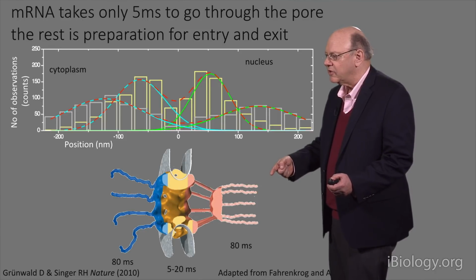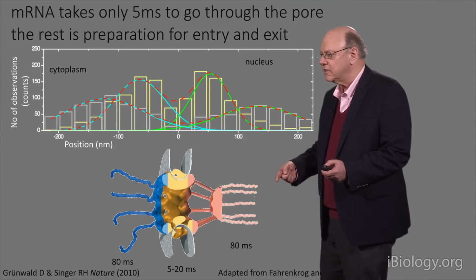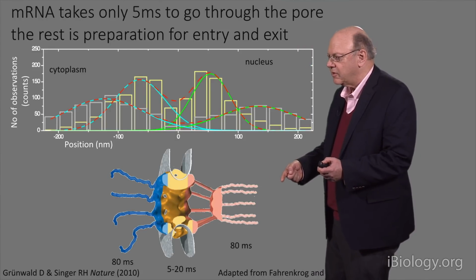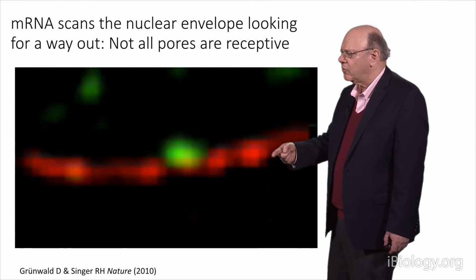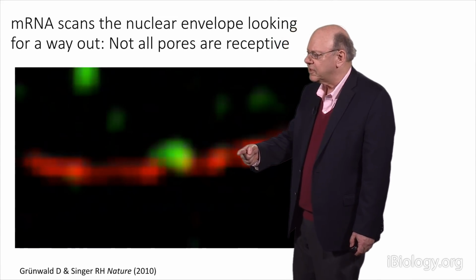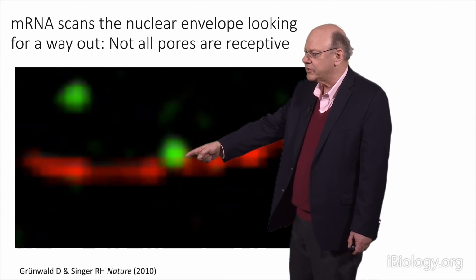Okay, and you can see other interesting observations when you're looking at this in real time. For instance, here's an example where this particular RNA molecule is searching for a pore that's going to let it out.